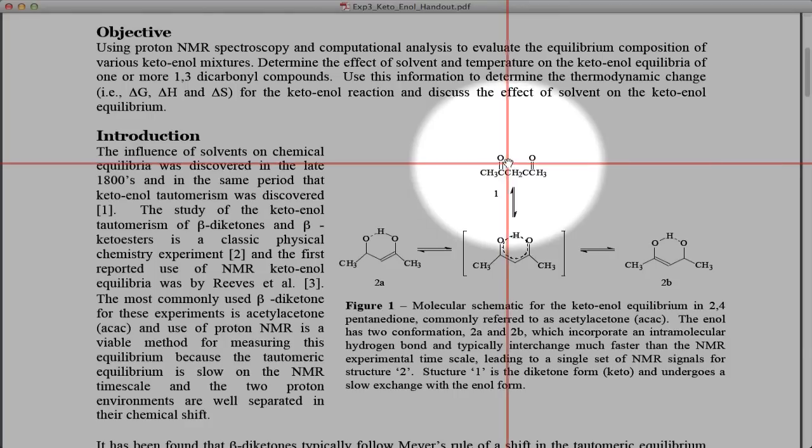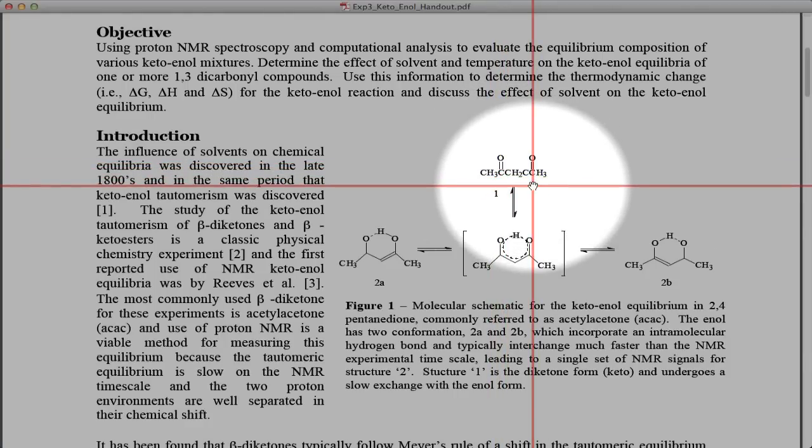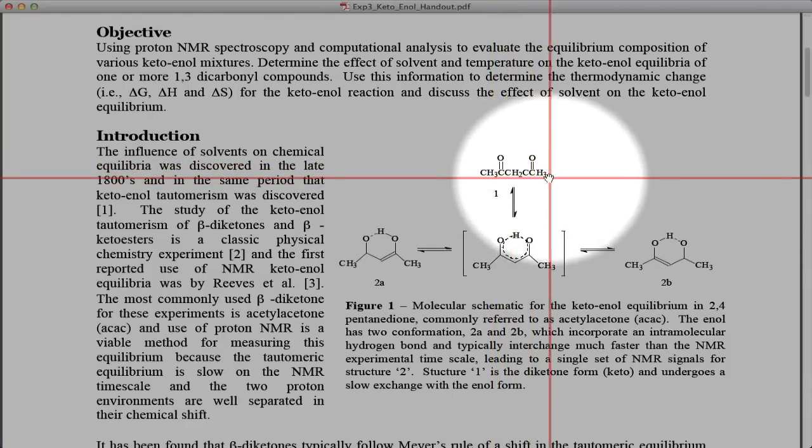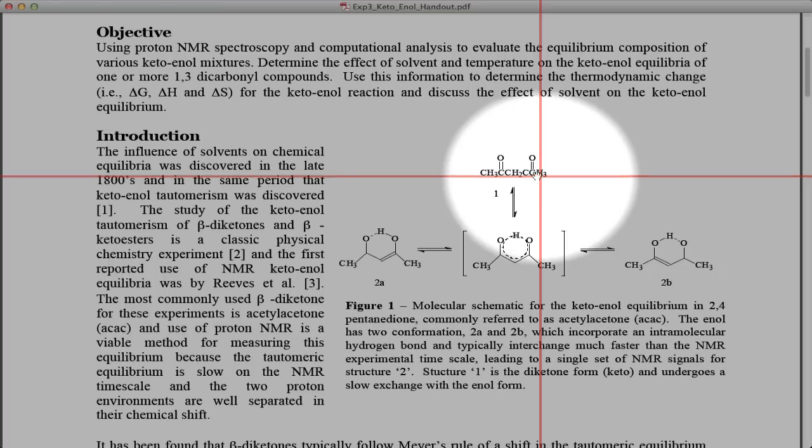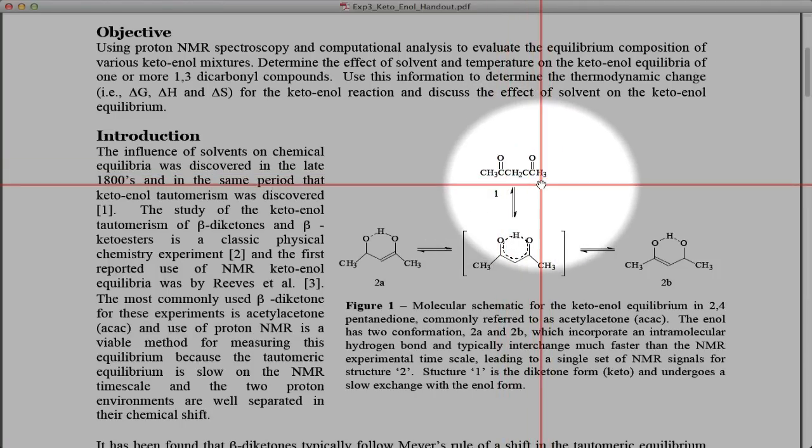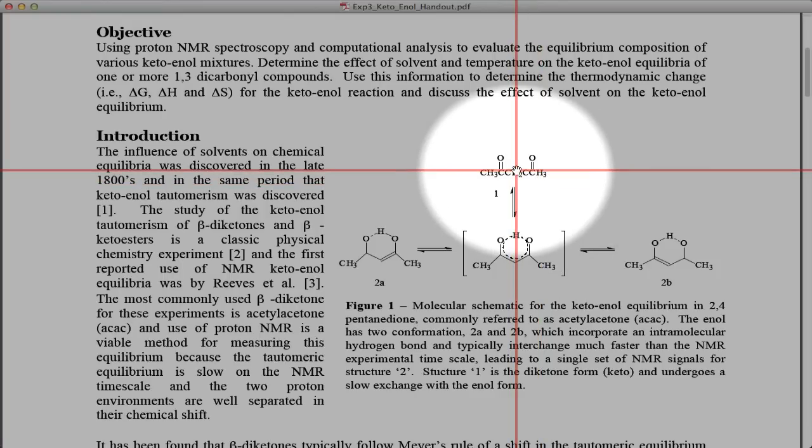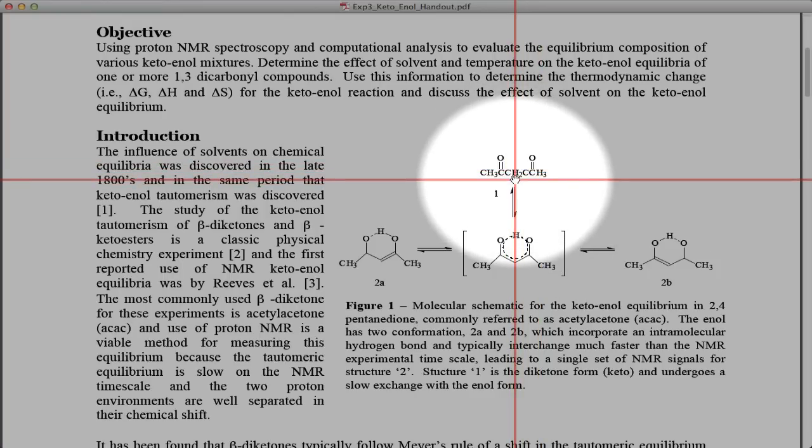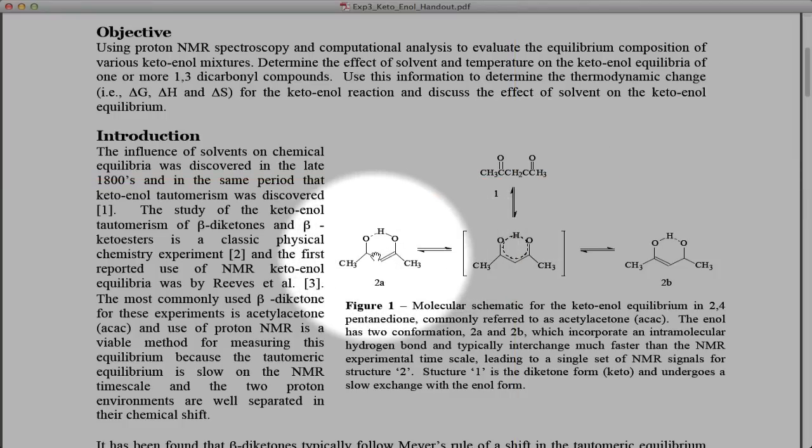We can easily start to see why NMR would be good. If we quickly look here we have two methyls, they're equivalent by symmetry to this molecule so we'll get one peak in the one or two ppm range for those six protons that represent the two methyl groups on this diketone, and then we'll get another one for the methylene in between.